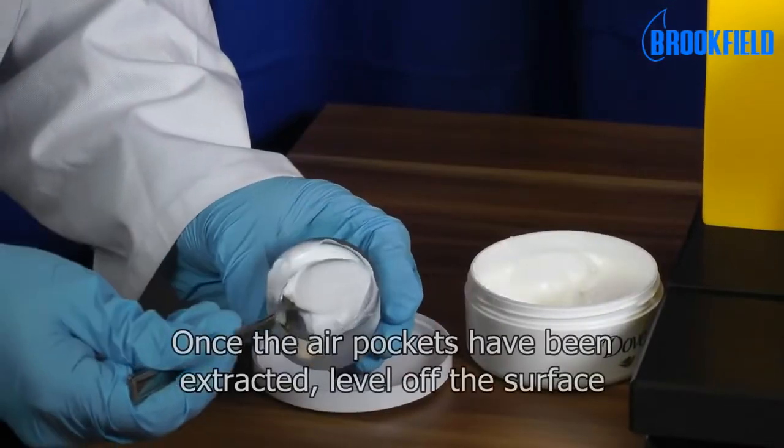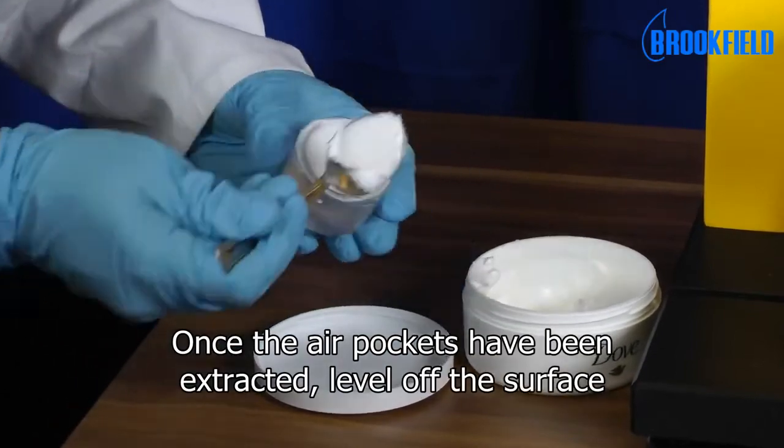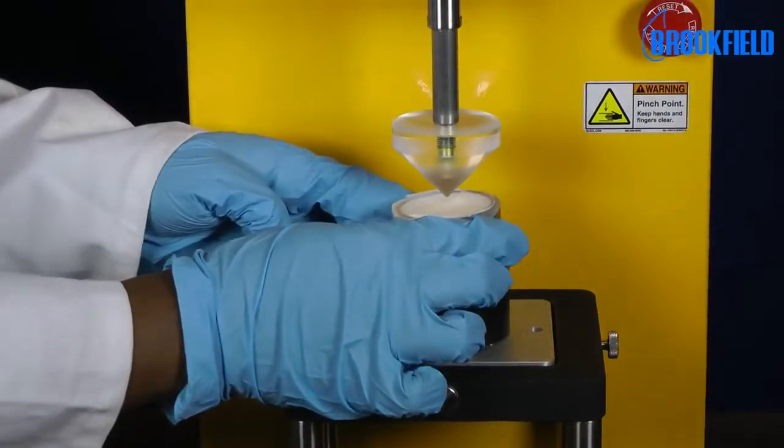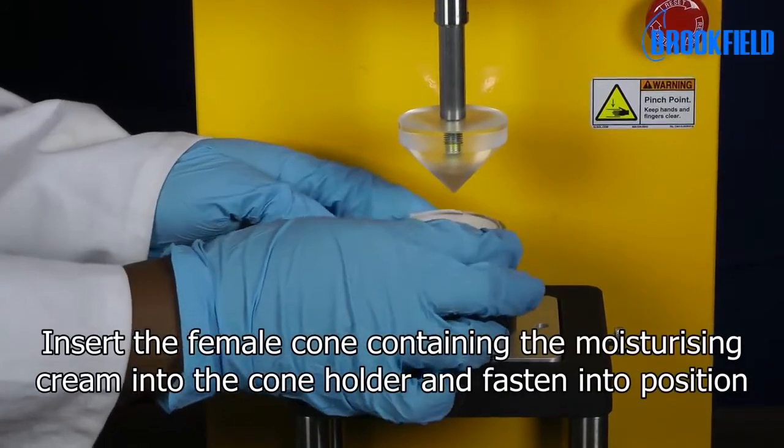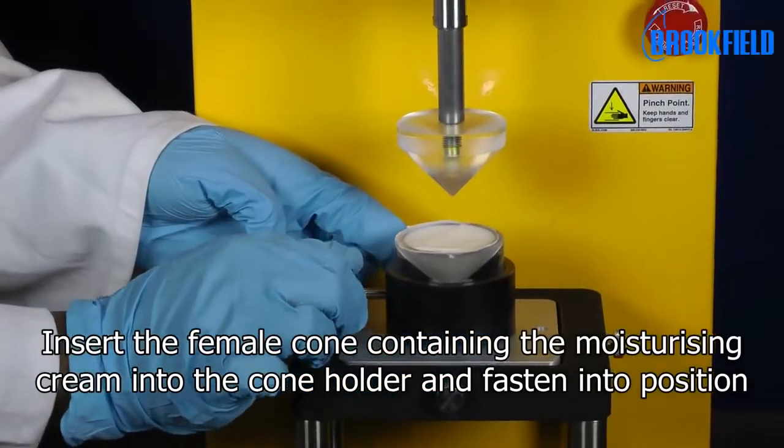Once the air pockets have been extracted, level off the surface. Insert the female cone containing the moisturizing cream into the cone holder and fasten into position.